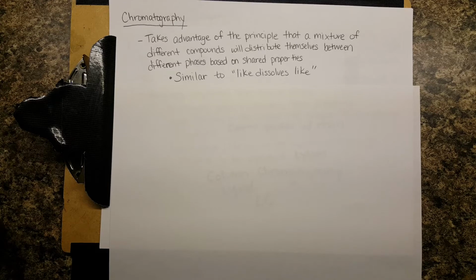So chromatography takes advantage of the fact that if you have a mixture of different compounds, they're going to distribute themselves in specific ways based on the properties that they have. So it's kind of like a like dissolves like sort of thing. If you've got a lot of polar molecules and you're using chromatography where you have resin that's polar, those polar molecules are going to want to hang out more with the resin and take a longer time to elute from whatever column you have or to move through whatever stationary phase you have.